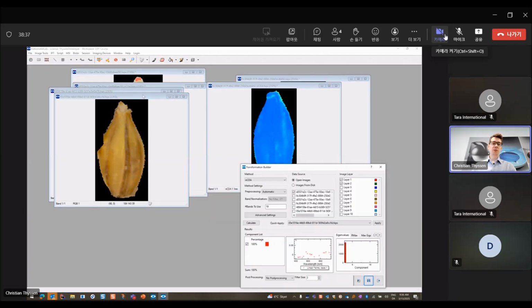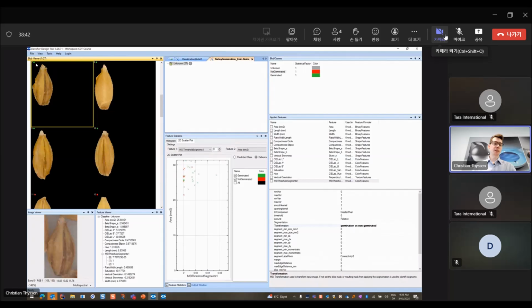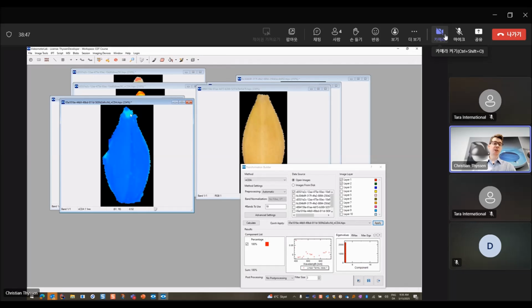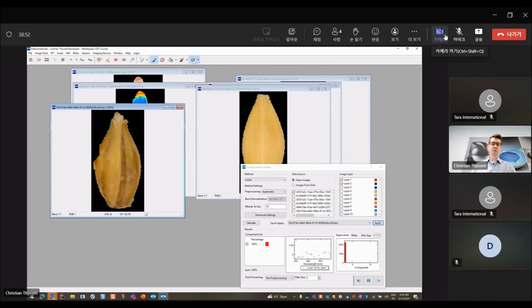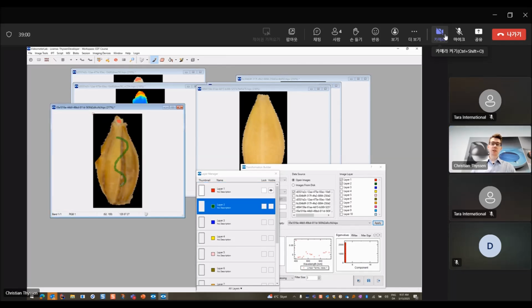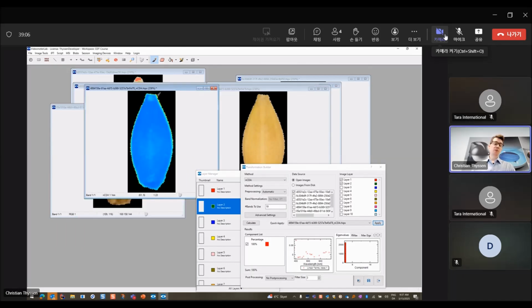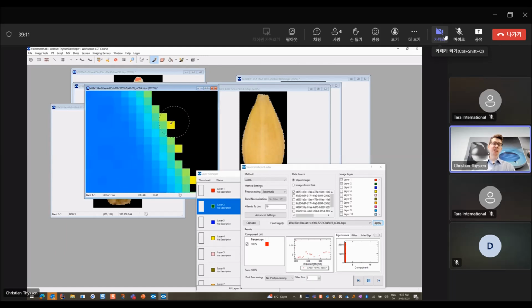So here on the left, clearly we have a seed which is germinated, and we can just confirm it by going back. So in this case, if we apply, we find nothing. So in this case, we would go in and paint that part of the seed like this, and the other part green. And here the transformation actually works quite well, but maybe if we zoom into the border, we see that it's because of the borders that we actually get some signal.